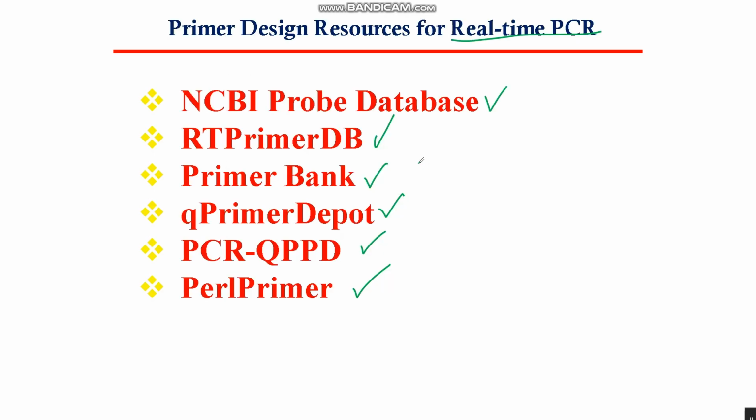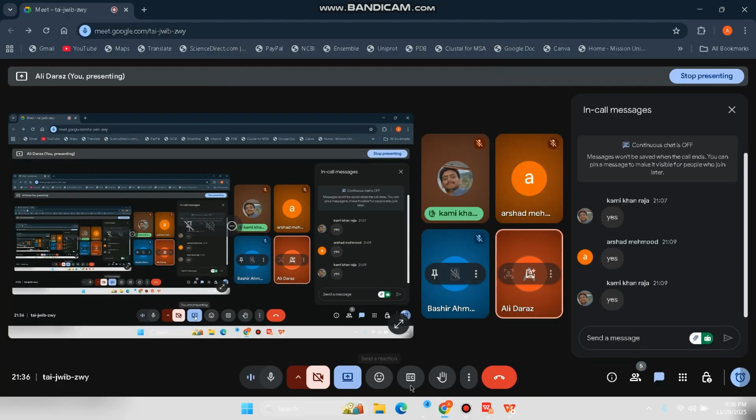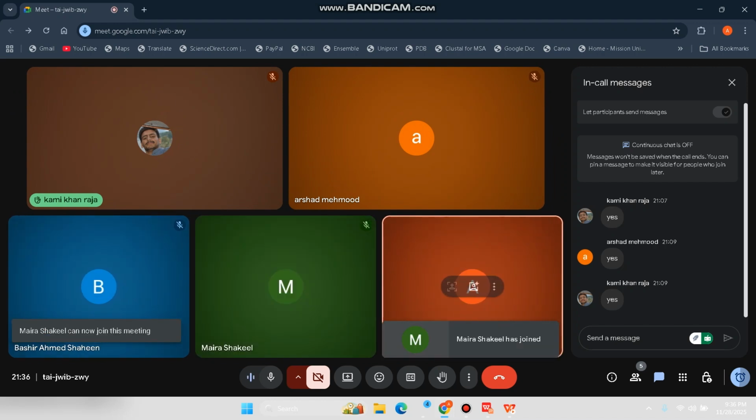Okay, now if you have any question, you can ask me in the chat box. After it we talk about the PCR optimization. First of all, if you have any question about PCR or the primer designing, you can ask me in the chat box. You have 5 minutes.